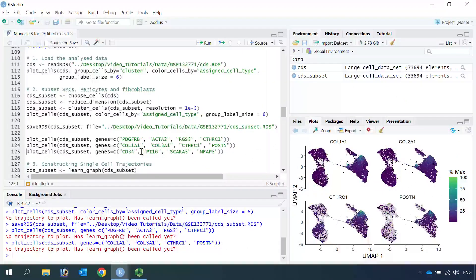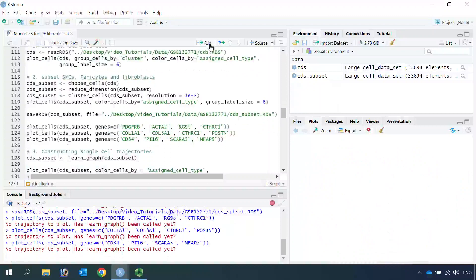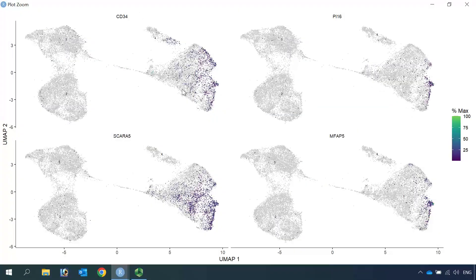We also want to make one more plot to see the CD34 and PI16-positive fibroblast cluster, because this cluster of cells has been confirmed by previous studies to give rise to all fibroblasts in human lungs, including healthy lungs and fibrotic lungs. Let's plot the markers CD34, PI16, SFRP2, and MFAP5. You can see these markers label the adventitial fibroblast cluster.